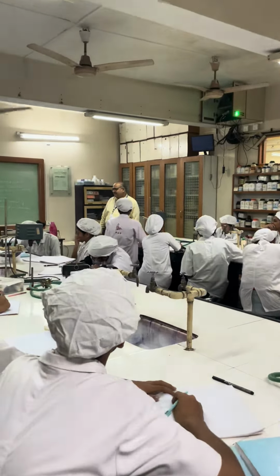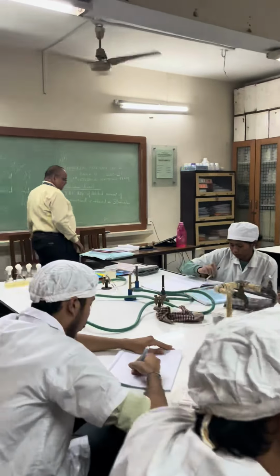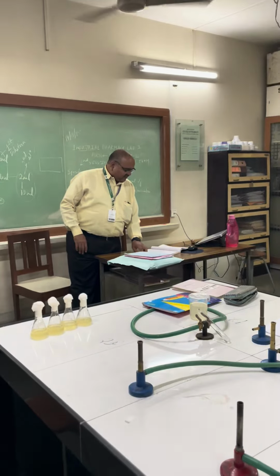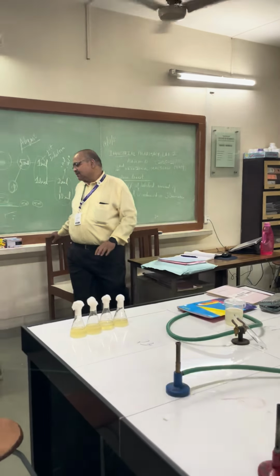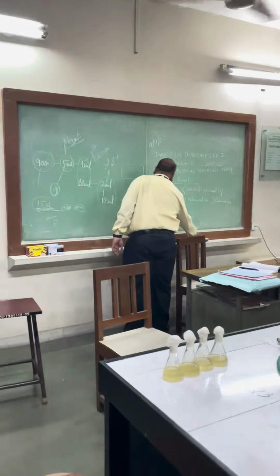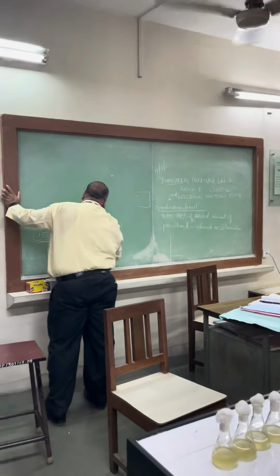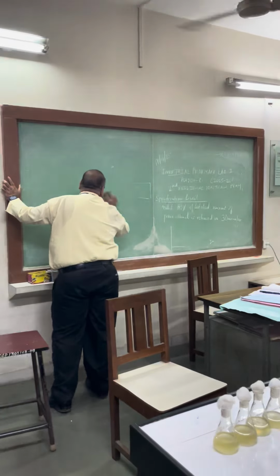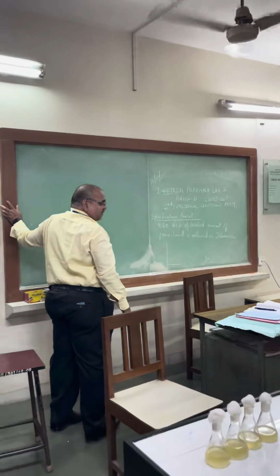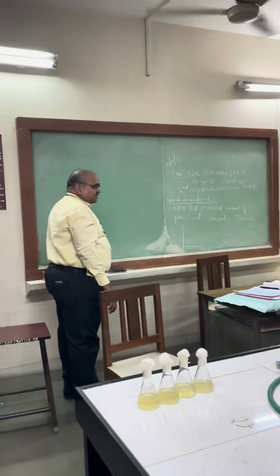Now here, in case of amylase test, the amylase test is the test which is used to detect amylase activity, to study the amylase activity of different bacteria. Now what is done in this test? Requirements for amylase test: 24 to 48 hours old culture of Bacillus cereus, Staphylococcus aureus and Escherichia coli.